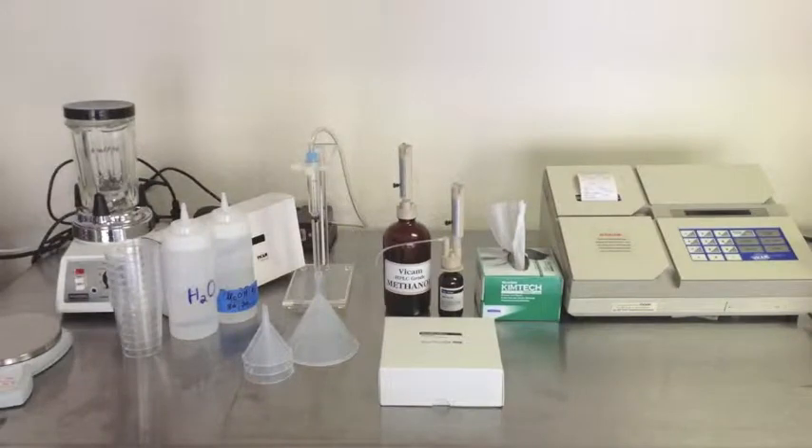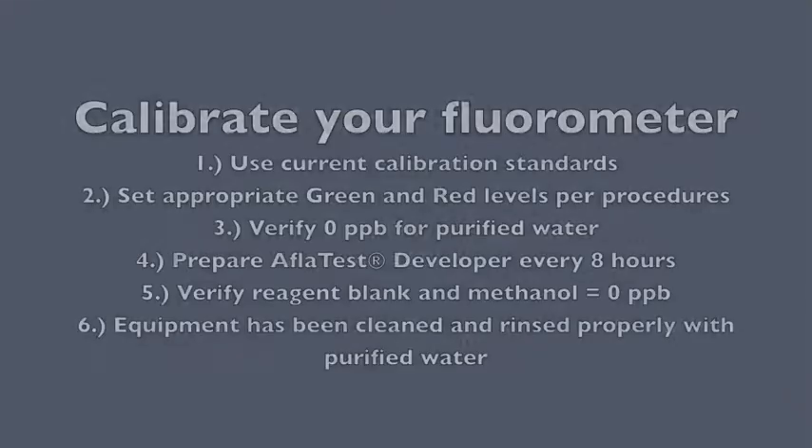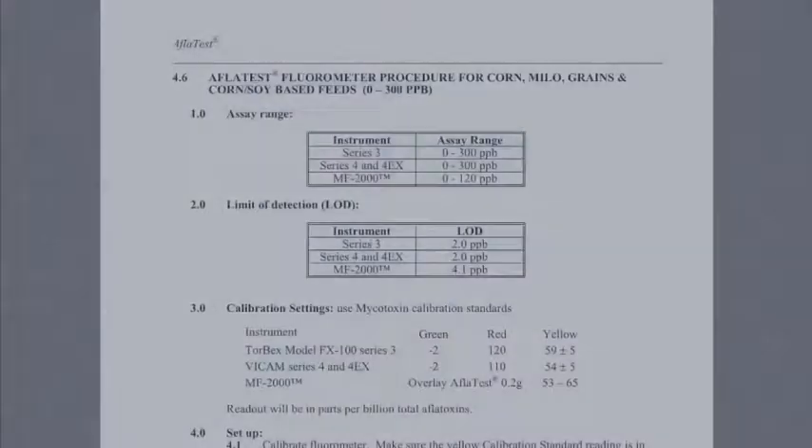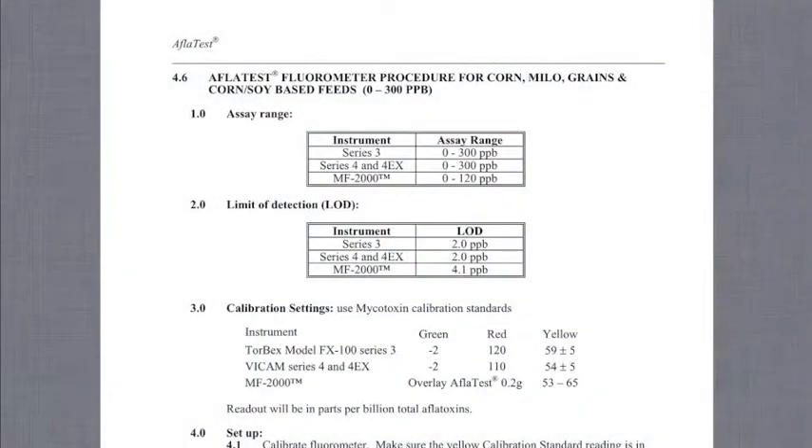Prepare your lab area, calibrate your fluorometer, and prepare your 80-20 mix of methanol and water. Prepare your AFLITest developer per the instructions on the bottle. Developer is good for 8 hours. Be sure that your fluorometer has been calibrated to the proper red and green calibration settings and tested with the yellow standard.